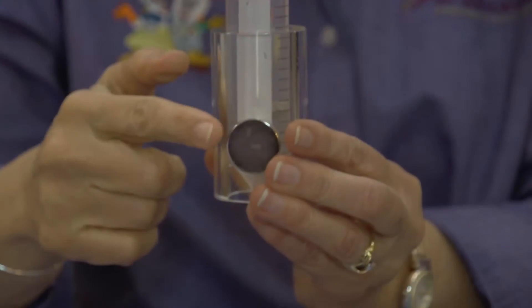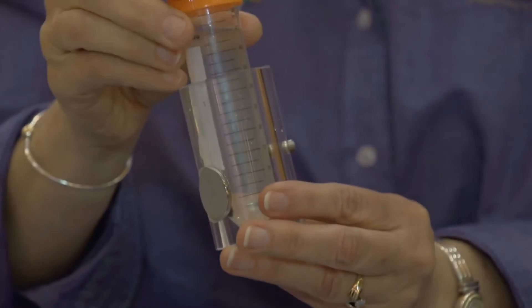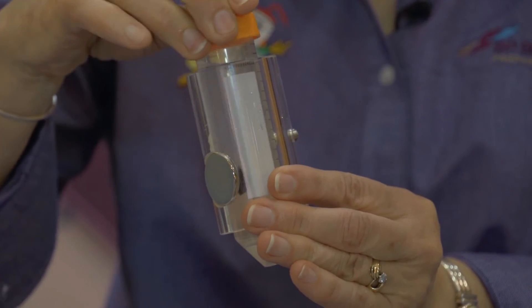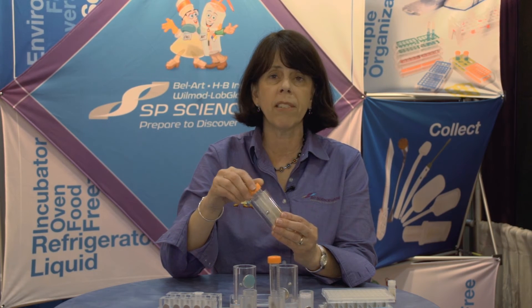Each sleeve has a magnet embedded on one side and the other side has a spring plunger. This spring plunger holds your tube firmly in place. At the same time, I can slide my tube up and down in the sleeve. This means that my beads will collect on the magnet at whatever my desired height is on the tube wall. Mixing is also easy in the sleeve — simply by turning the tube, I'll achieve mixing of my samples.